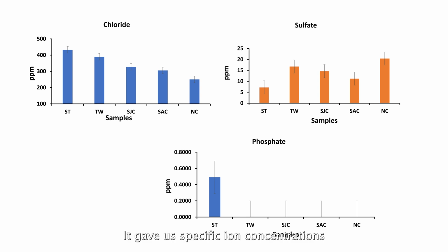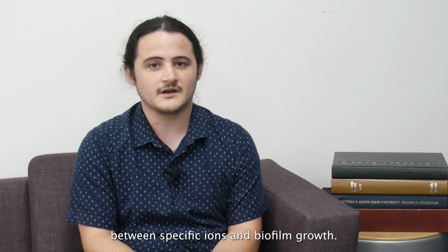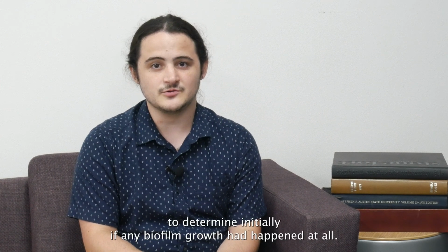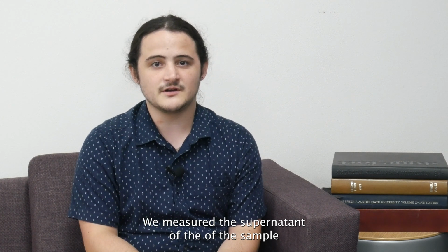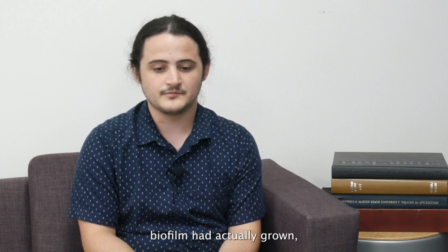It gave us specific ion concentrations in the supernatant of the biofilm samples. We use that data to establish relationships between specific ions and biofilm growth. UV-vis spectroscopy was also used as a way to determine initially if any biofilm growth had happened at all. We measured the supernatant of the sample to determine whether or not biofilm had actually grown.